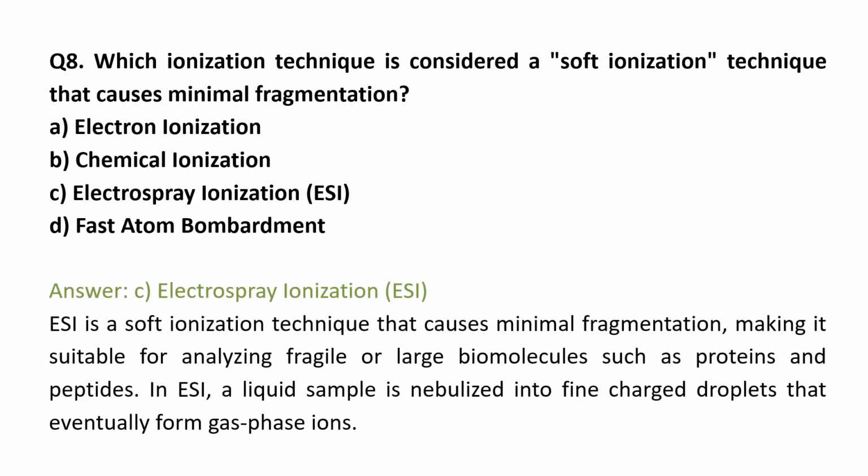So the answer is electrospray ionization. ESI is a soft ionization technique that causes minimal fragmentation, making it suitable for analyzing fragile or large molecules such as proteins and peptides. In ESI, a liquid sample is nebulized into fine charged droplets that eventually form gas phase ions.